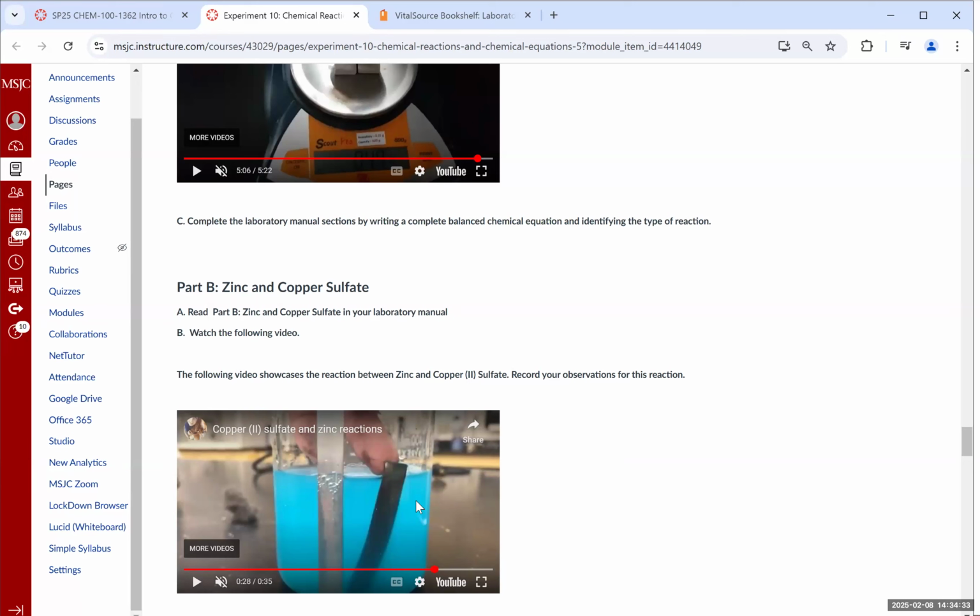That's actually the copper ions reacting with the zinc and depositing on the zinc surface as solid copper. In fact, if you were to break up the zinc and mill it into tiny pieces, you'd be able to collect and observe solid pieces of copper powder precipitating out of this solution.